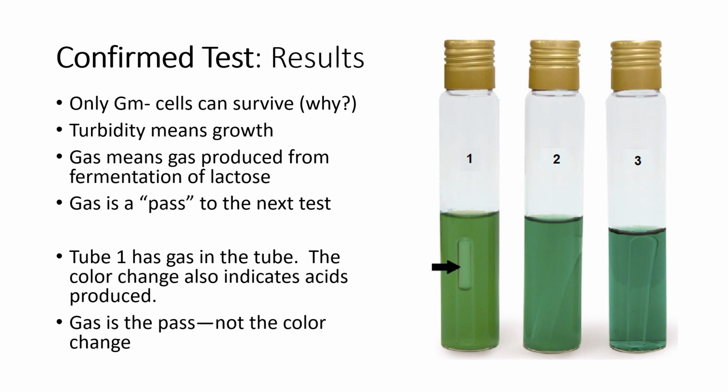I've got a gram-negative because I have survival. And not only is it gram-negative, it is a lactose fermenter with gas production. Oh, that's awesome. This is my pass. I mean, it's not awesome if it's your well water. Now you're really concerned. You know, for most people, their wells at this point have failed. And usually the only people who are moving forward are people who took water from, like, a fountain or a creek or something like that, but it could have been somebody's well.